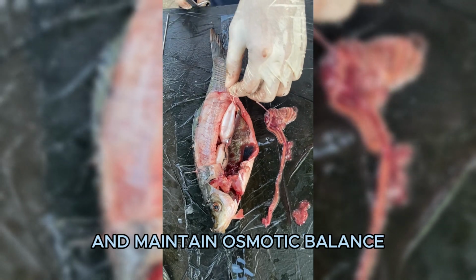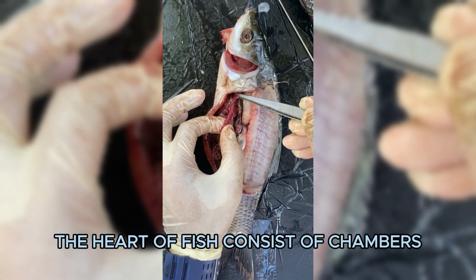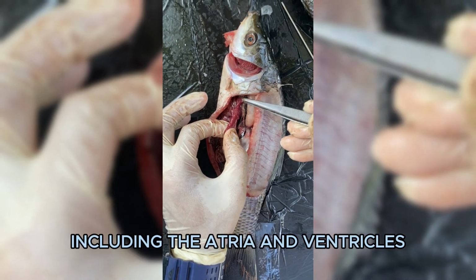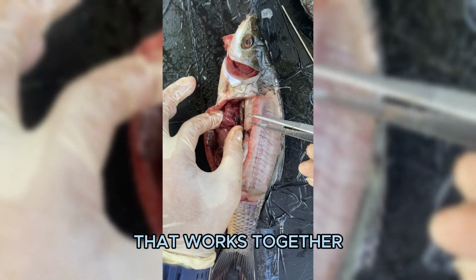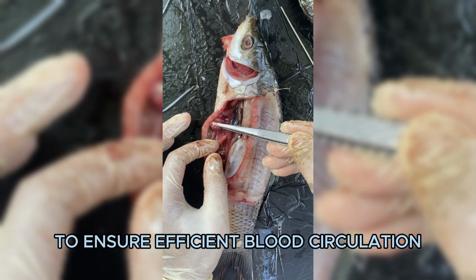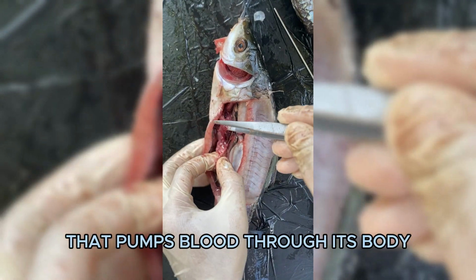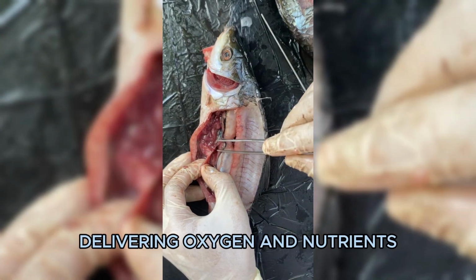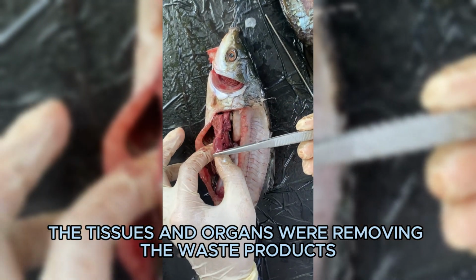As for the circulatory system, the heart of fish consists of chambers including the atria and ventricles that work together to ensure efficient blood circulation. The heart of a carp is a muscular organ that pumps blood through its body, delivering oxygen and nutrients to tissues and organs while removing the waste products.